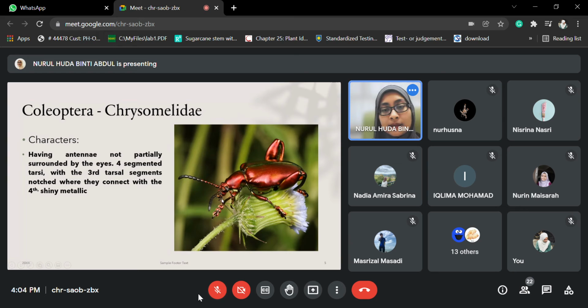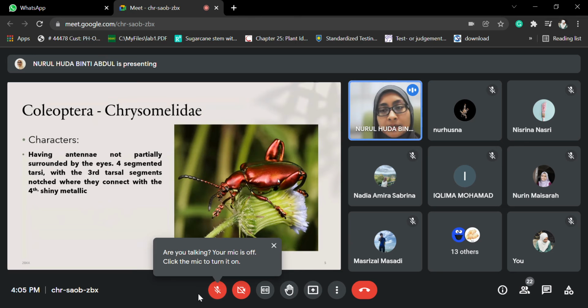Okay, so and then you can say other things juga lagi. What others yang you can say about this specimen? Apa lagi yang kamu rasa you can say about this specimen?